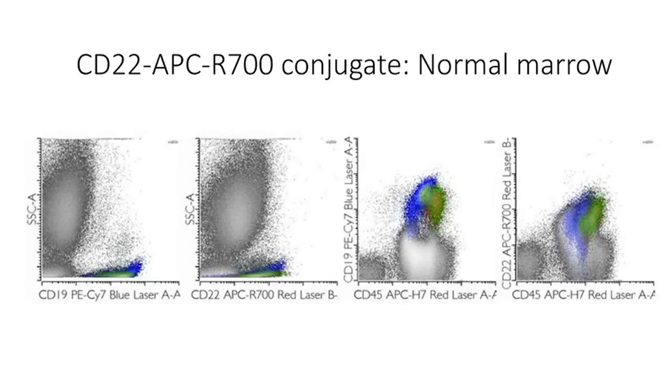the B cells. Here the same data are displayed in a different way versus CD45. The immature B cells have the weakest CD19, and it increases with maturation. CD22 is a little more complicated in development. It starts out sort of moderate, and then it drops down, and then it goes back up with maturation.